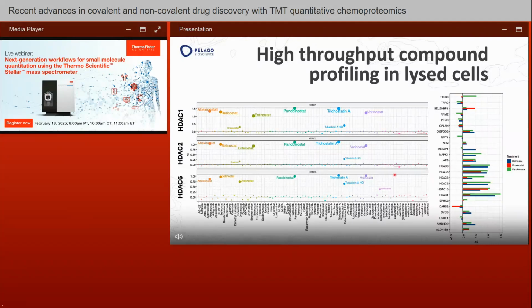We can turn around and plot proteins as an axis and then color code different compounds, in this case 3 HDAC inhibitors being color coded, and that also allows us to spot some differences and similarities between these different HDAC inhibitors. If we look, for instance, at HDAC1, we can see similar thermostability shifts by panobinostat in green and belinostat in blue, but much lower for droxinostat in red.